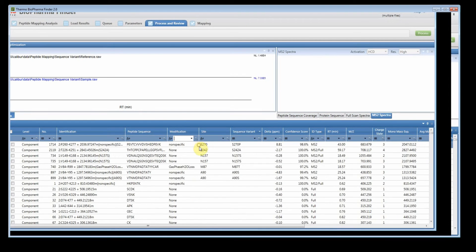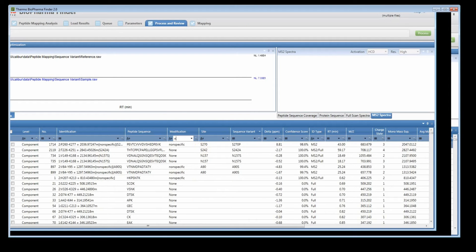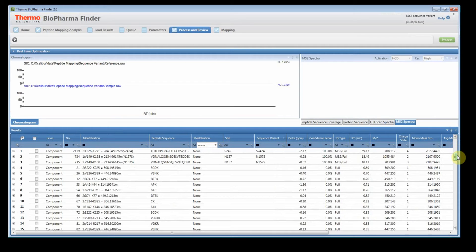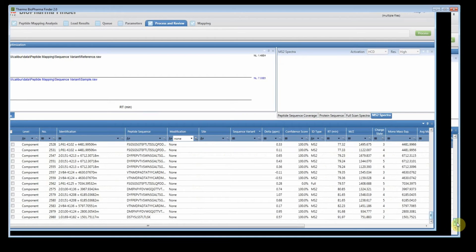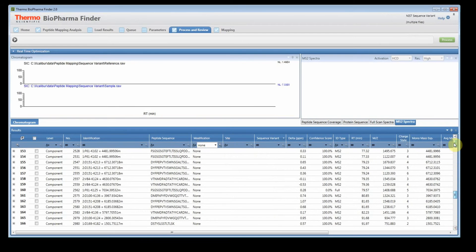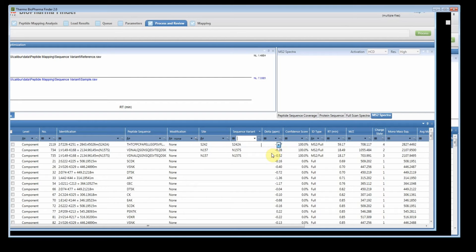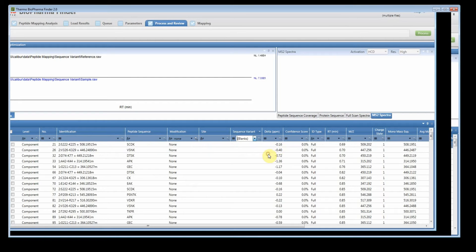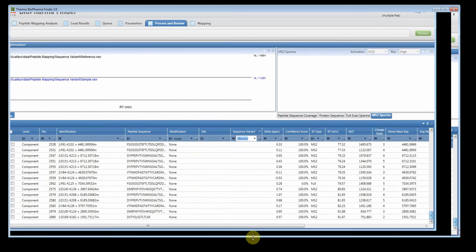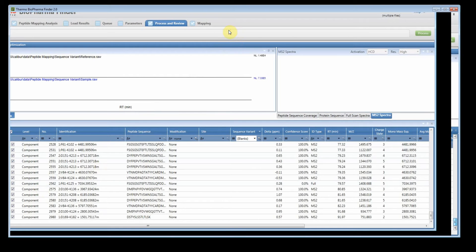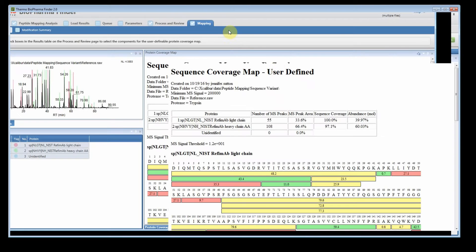So if we do that and we scroll down, these are all none for modification. Now we are including our sequence variants, so let's get rid of those. So we don't want those either. And so now we have a total of 163 components. So if I check these, I have to check them. Come to the mapping tab and what you'll see is now it's user defined.